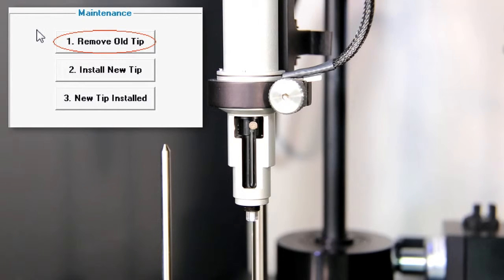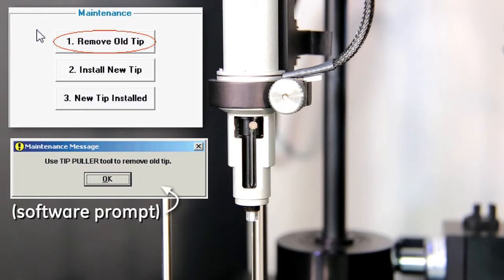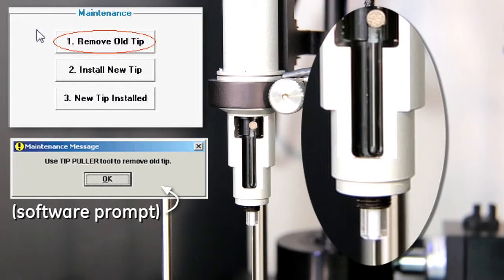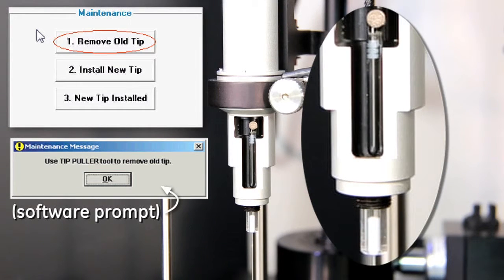Then we click the remove old tip button in the ITC 200 software's instrument controls tab. This prompts you to remove the old tip, which we're not doing in this step, but the action of the plunger aids in removal of the syringe glass.